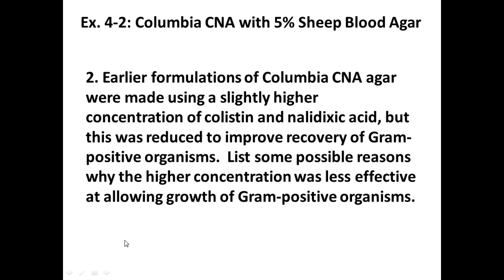That's what non-selective medias do. Earlier formulations of the Columbia CNA plates were made using slightly higher concentrations of the two antibiotics, colistin and nalidixic acid, but this was reduced to improve recovery of gram positives.